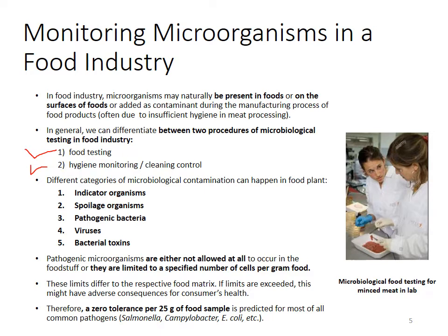As you can see in the figure here, microbiologists are taking samples of food, minced meat, daging hancur, and then they want to conduct the culture method, the standard plate count test, to detect the microbe.